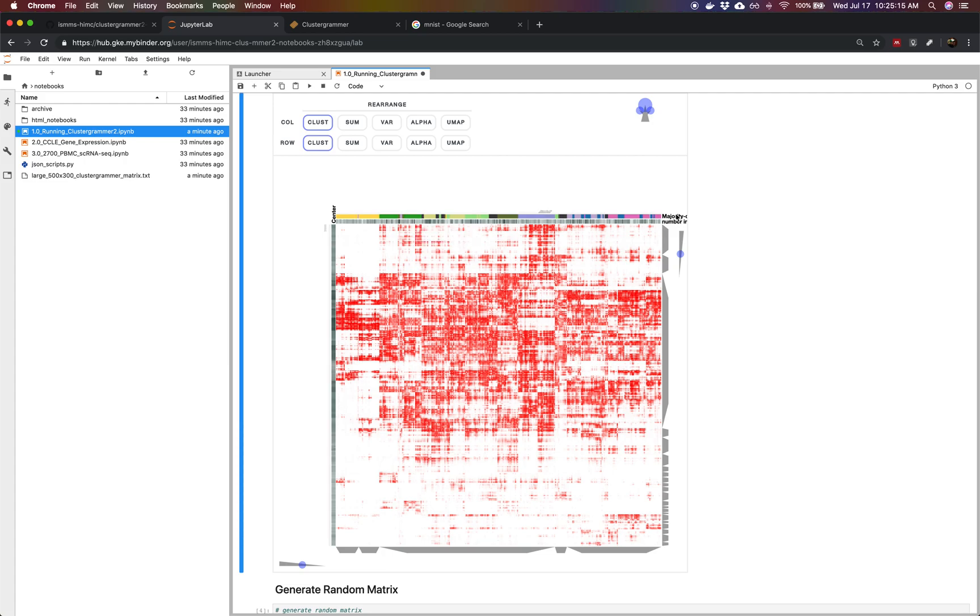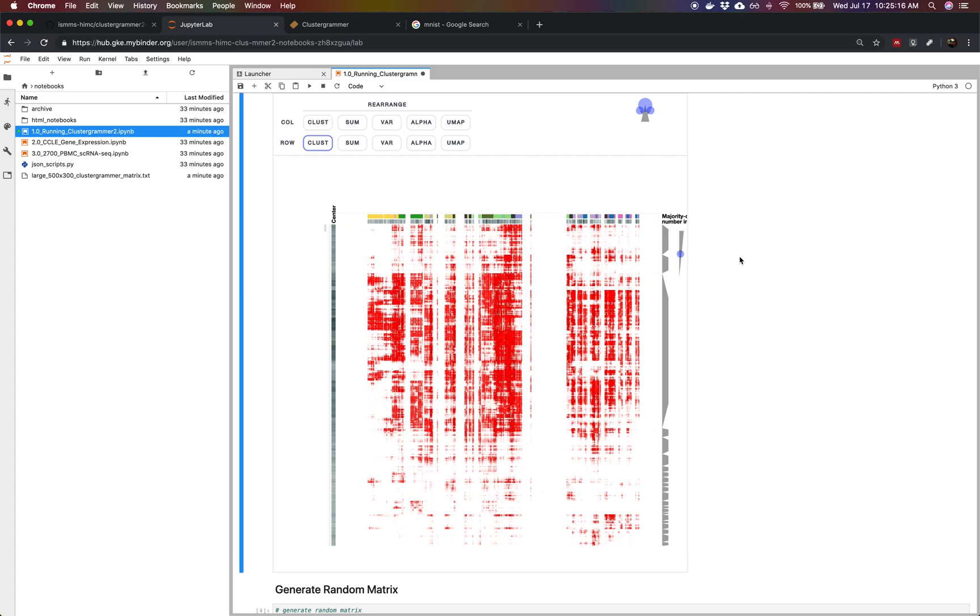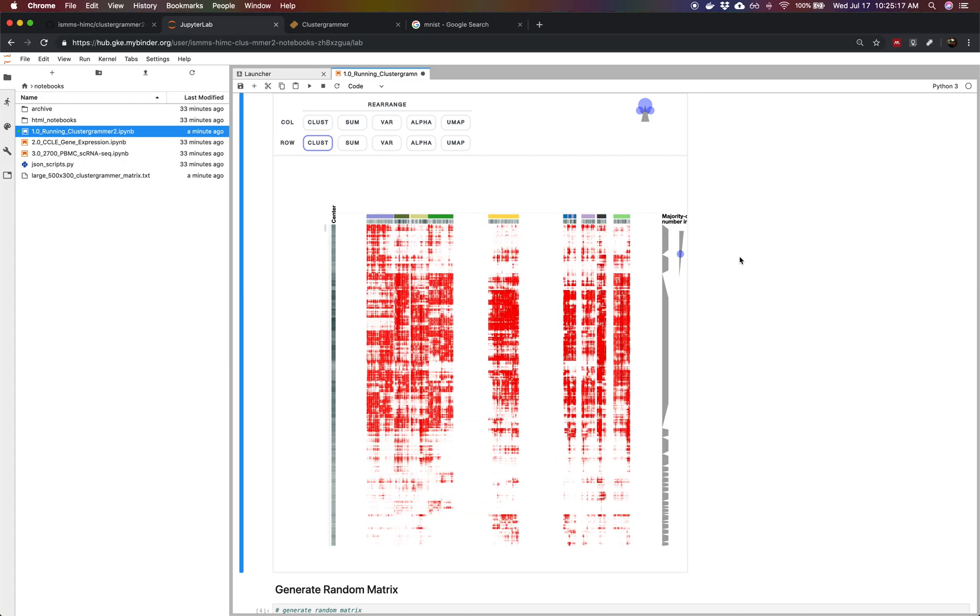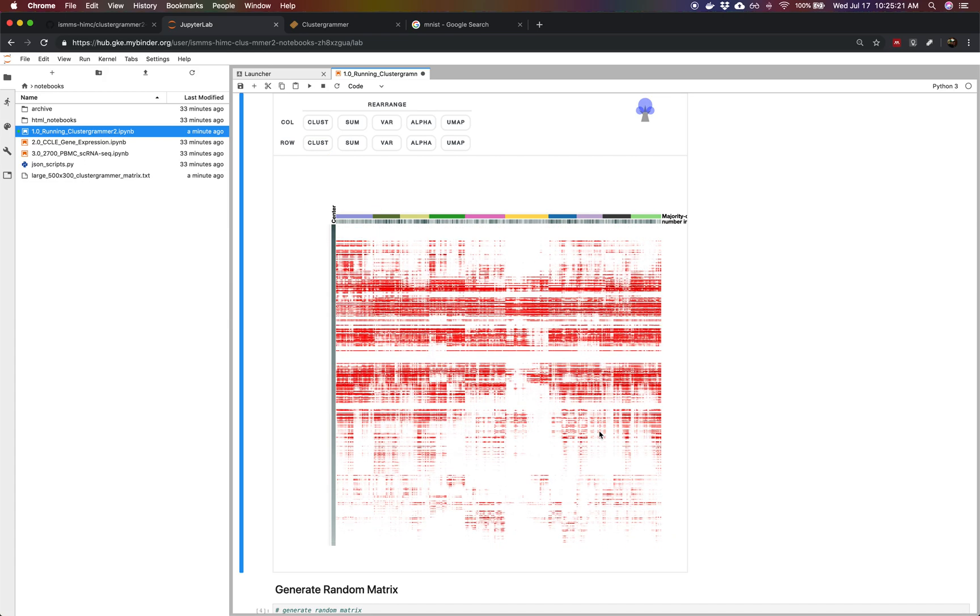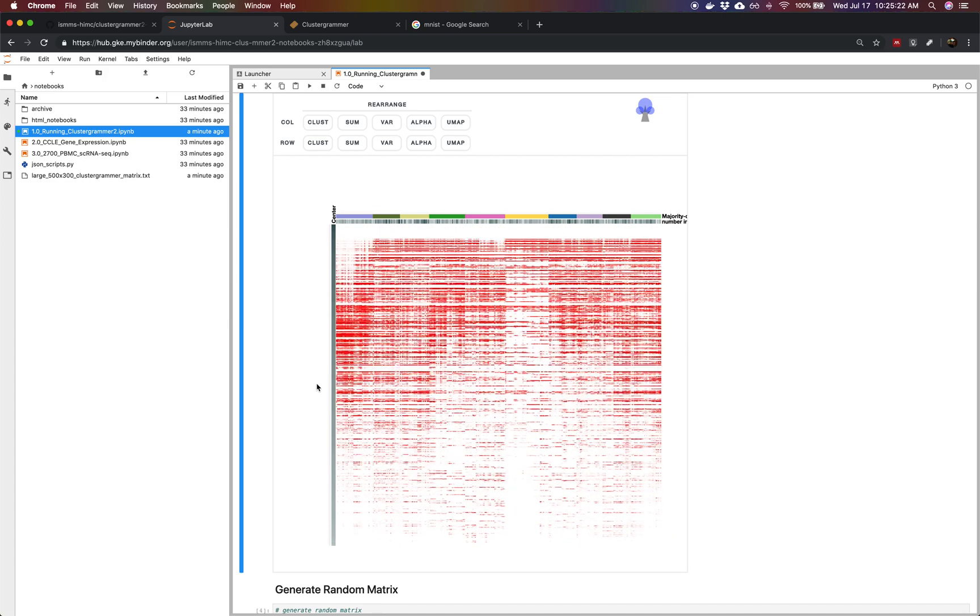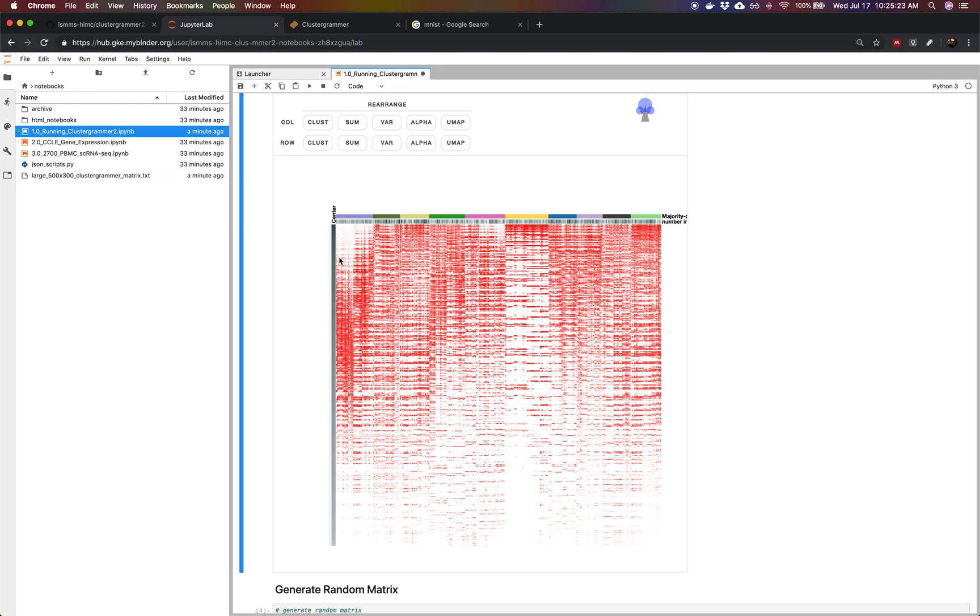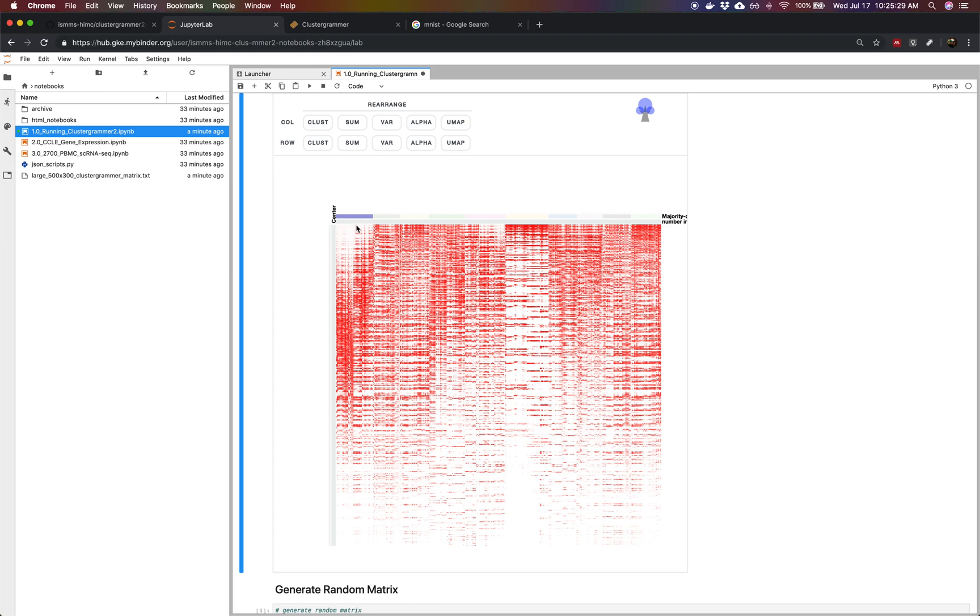We can reorder all of our handwritten digits by their identity. Then we can reorder the pixels based on how close they are to the center of the image. We can see obvious patterns like zeros have very little pixel intensity in the center, which makes sense. But then you also see other patterns and other numbers.